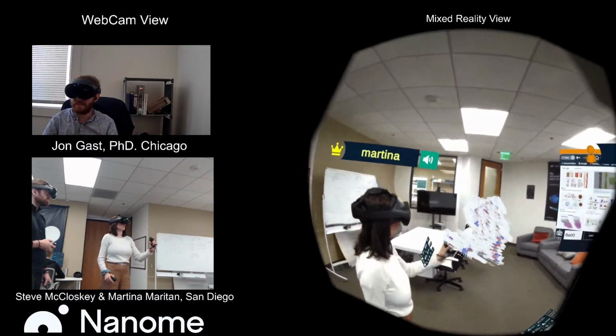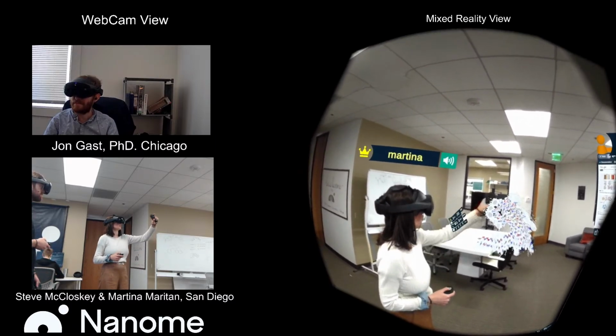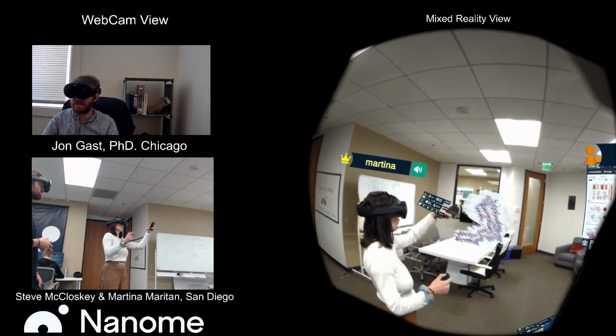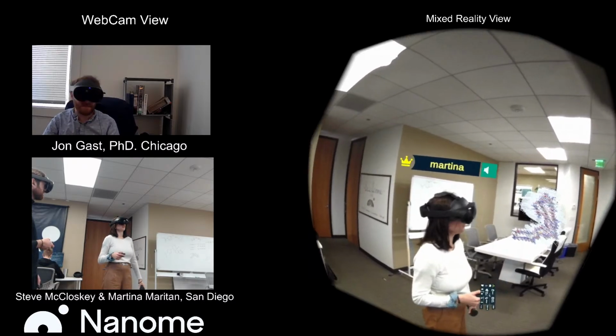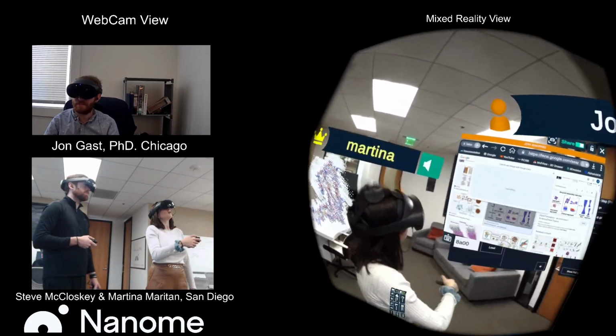However, prions also have a tendency of misfolding and refolding into a very organized and stable structure that we call amyloid fibrils. And here we have a nice example of that.